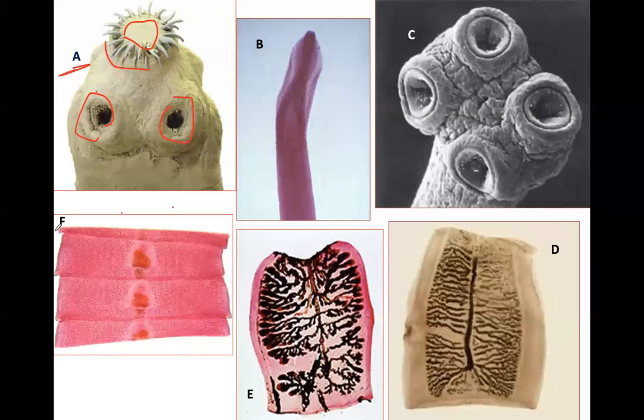So what would F be? Edward Mbona, you're asking whether we can say it's a crustacean? I don't think you should say it's a crustacean, because crabs are also crustaceans. It's just like seeing a monkey and a human being and saying they're both Homo. But Homo what? Homo sapiens, Homo erectus, Homo what? So you can't say just crustaceans. You have to specify a copepod in that context, right?